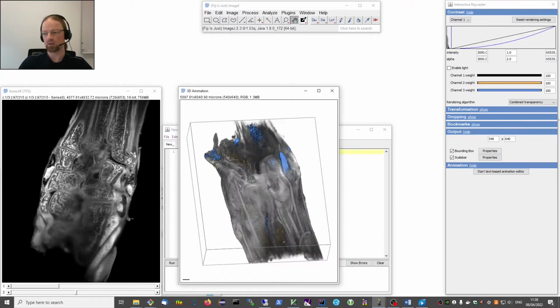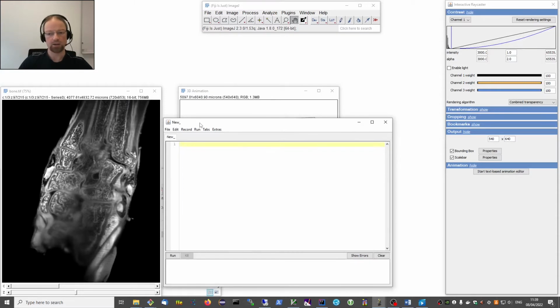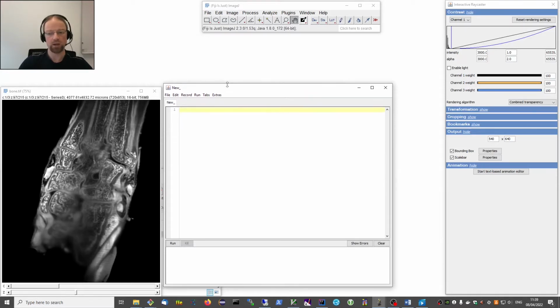This is the next step now. You have basically seen all the features that the 3Dscript renderer provides. And the good news is that you can animate all of these numbers, which you can change here, over time, creating effects and animations. The way you do this in 3Dscript is by telling the software in English sentences what you want to animate. This is actually the major motivation behind developing 3Dscript.